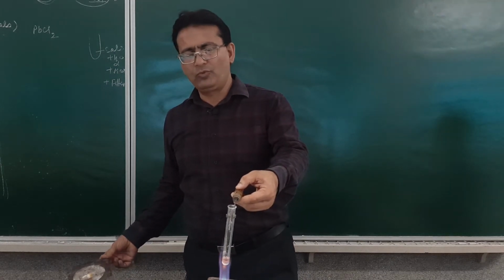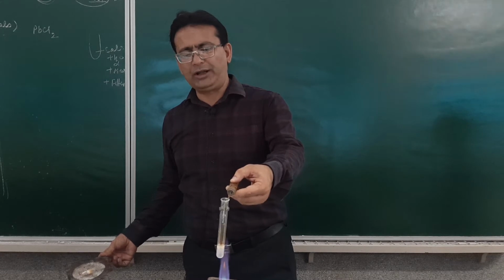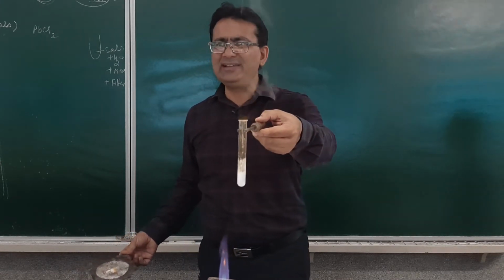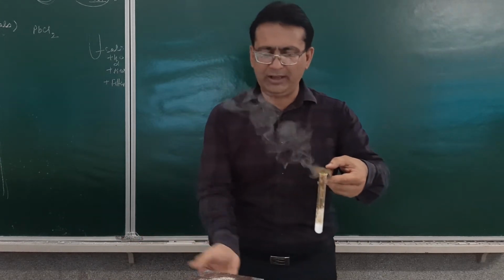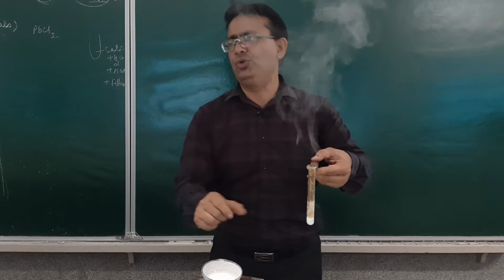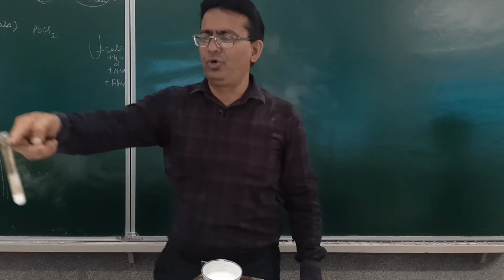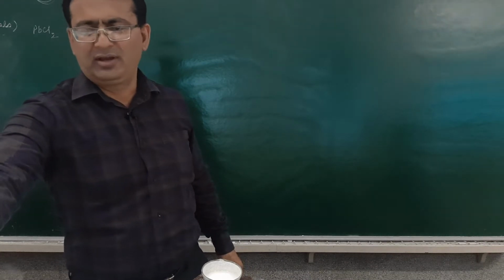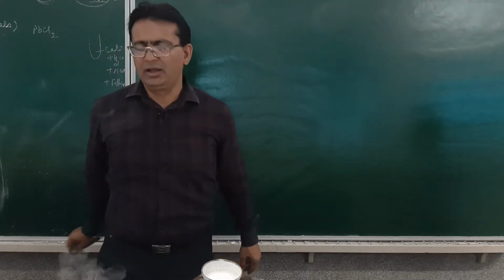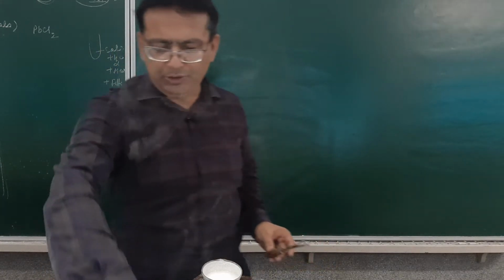Just see what gas will be given out. A reddish brown gas will be given out, and this reddish brown gas is nitrogen dioxide. Can you see this? This indicates the presence of a nitrate ion in the given salt. The second demonstration I will give you will be by use of a sodium carbonate extract. Name the reddish brown gas: nitrogen dioxide.